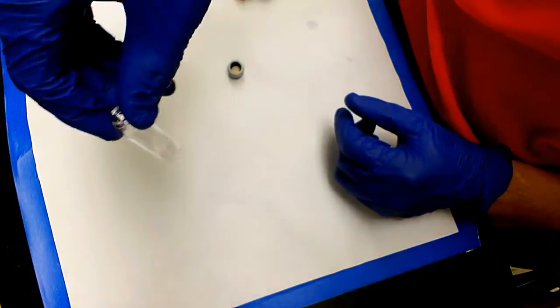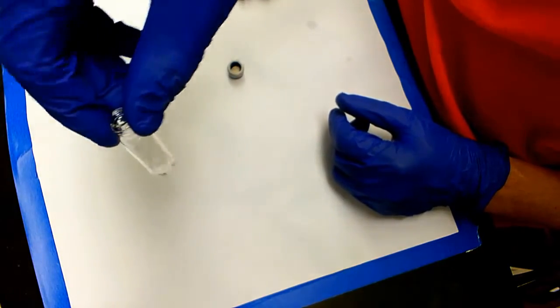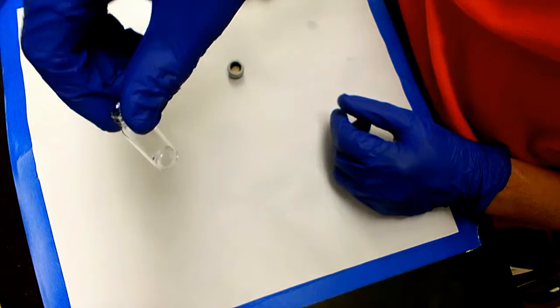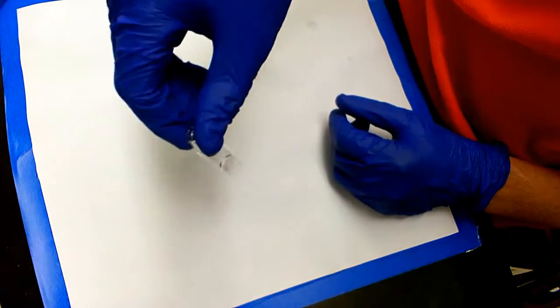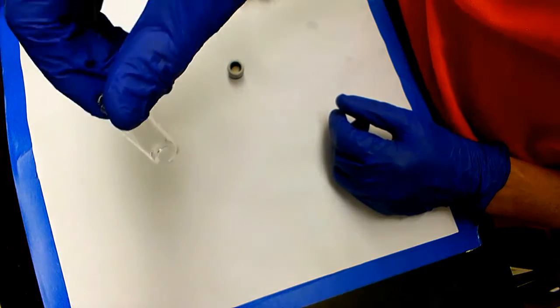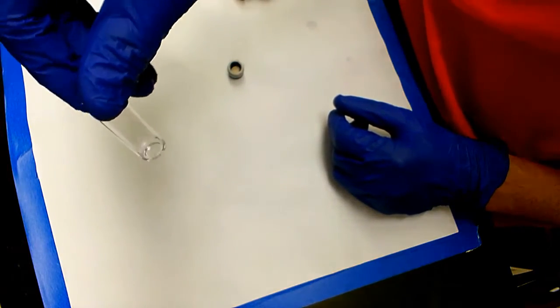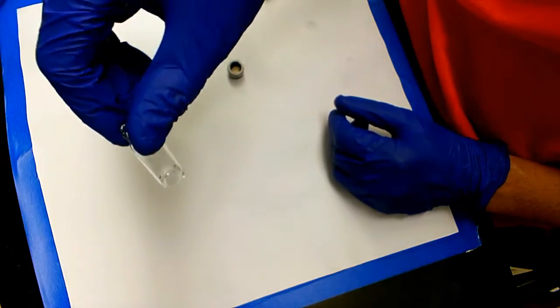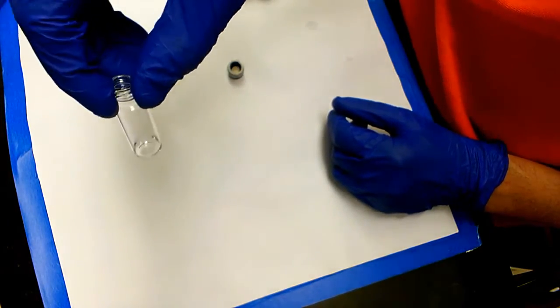So this is now the polymer solution we're gonna drop cast on a clean glass cover slip, and then put that on a hot plate and just let it dry. The hot plate should be set to about 40 degrees centigrade to speed up the drying process, and after 1 hour you should be able to obtain a uniform polymer thin film.